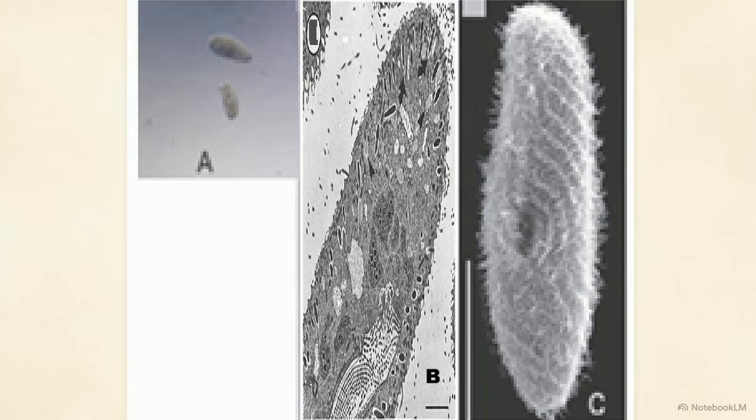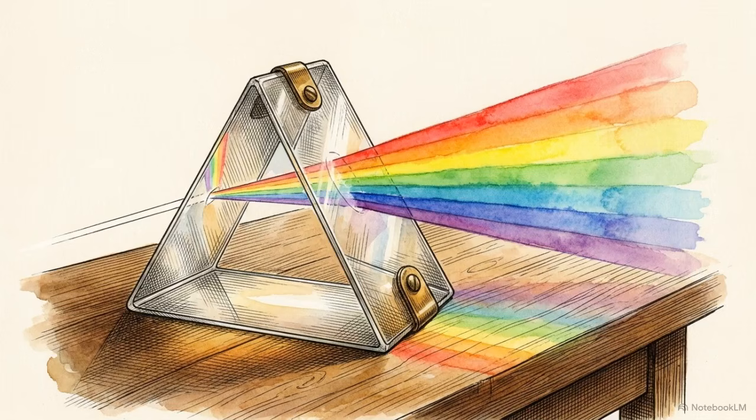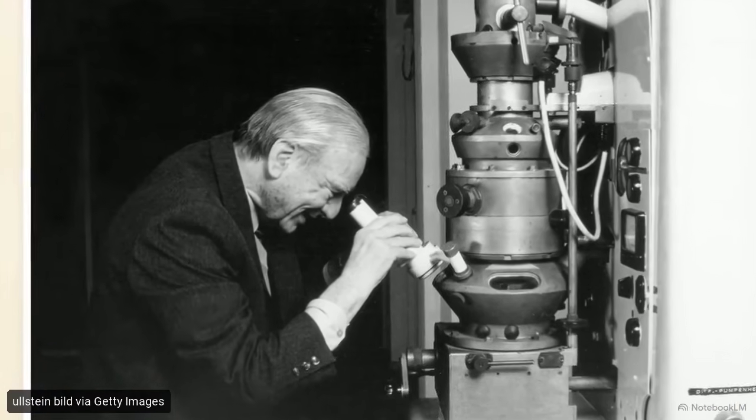This image of a paramecium was captured using a transmission electron microscope, or TEM. Firing electrons directly through an ultra-thin slice maps its internal architecture in two-dimensional detail. Alternatively, a scanning electron microscope bounces electrons off the surface, revealing a rich three-dimensional topography. By stepping outside the spectrum of visible light, the very medium our eyes evolved to process, scientists bypassed the ultimate optical barrier and began mapping reality at the nanometer scale.